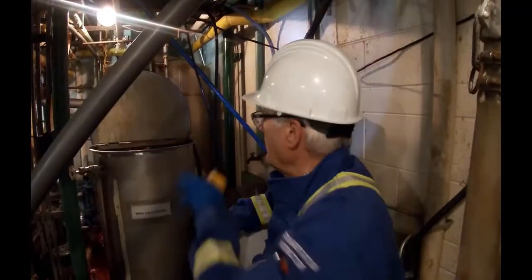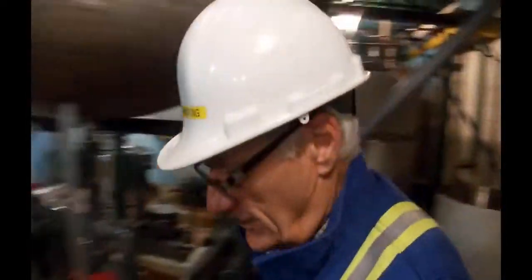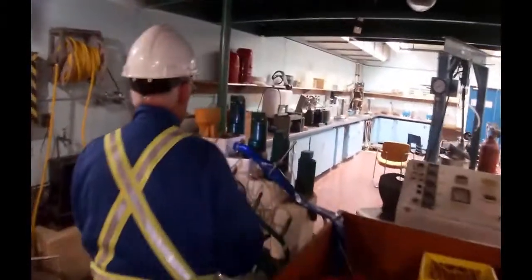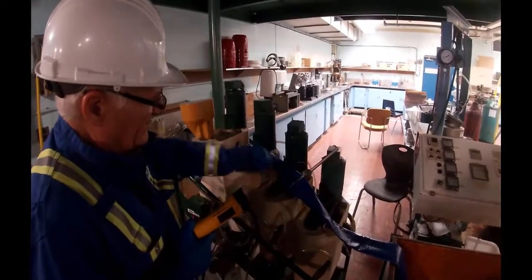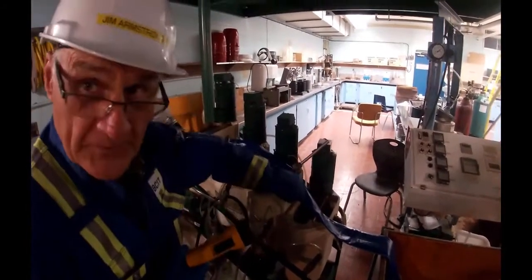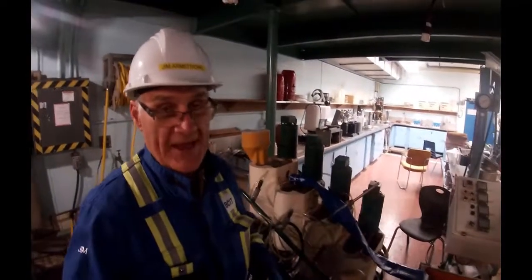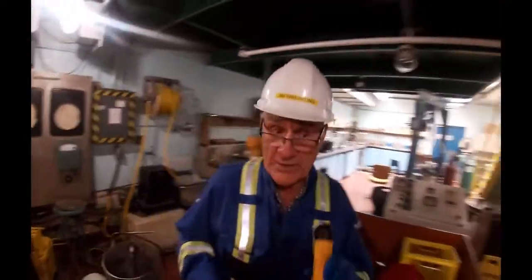In a pulp mill, when they're mixing this stuff up, it cascades down on a device like this. So it actually will overflow from one to the next, to the next, to the next. You can see how it goes underneath and then overflows, and underneath and overflows. It's called a classifier, and that's where they actually do the mixing. So it's not strong agitation, because you don't want to pull air in.